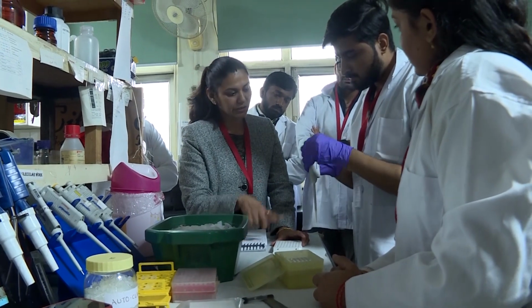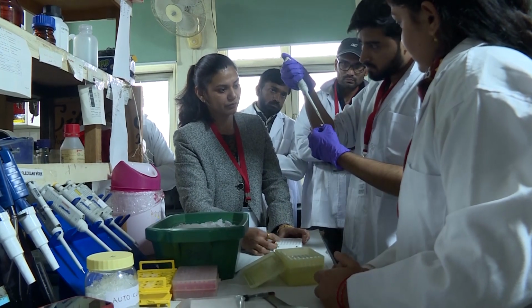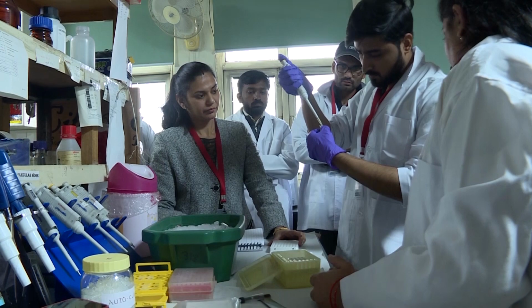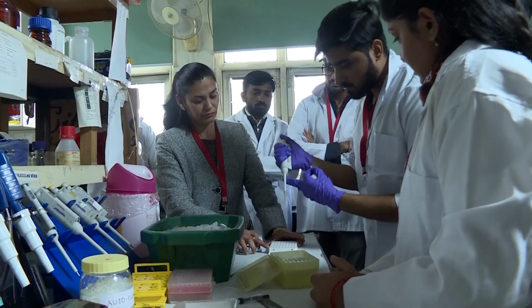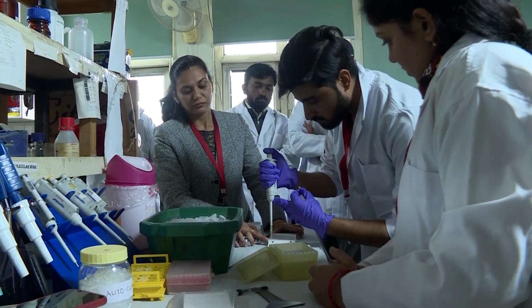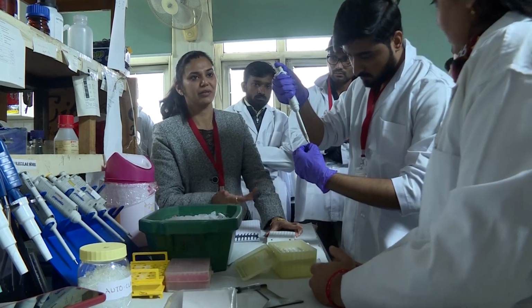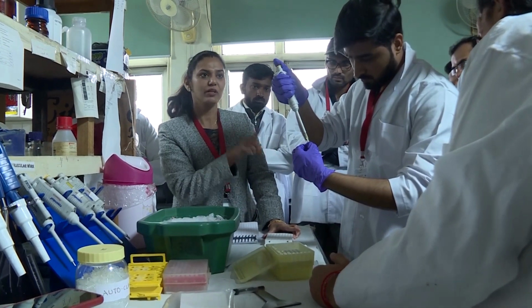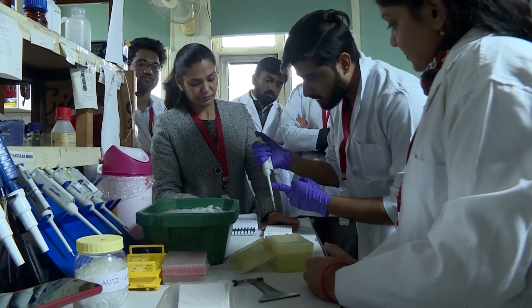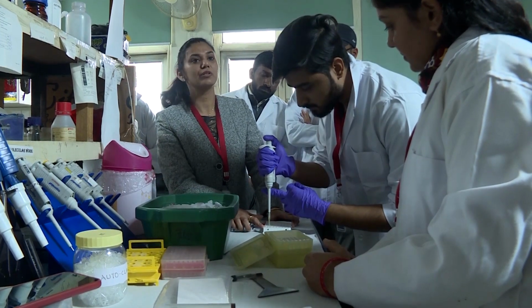This one. This is total 40 microliter. So 20 microliter in A1, 20 microliter in B1. Try to put it at the bottom. Same tip you can use here because there is only sample distribution, same thing is there. So for one sample, one duplicate. A1, B1. So this is our control gene.